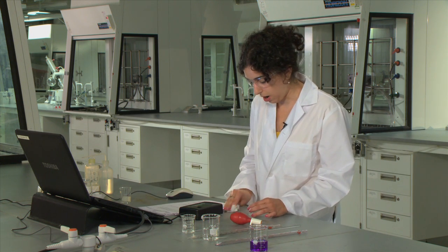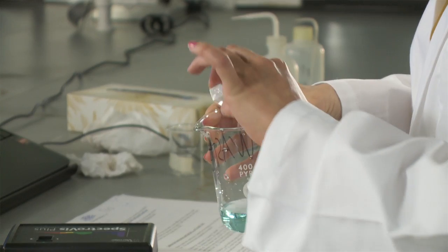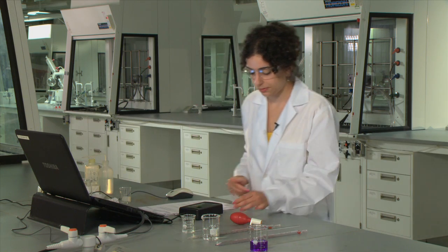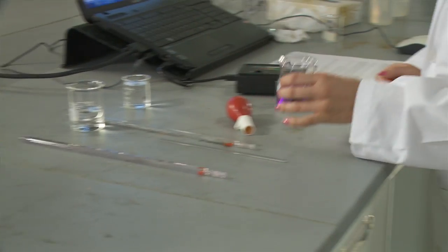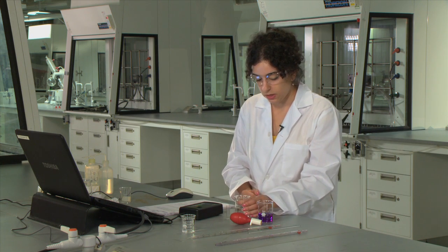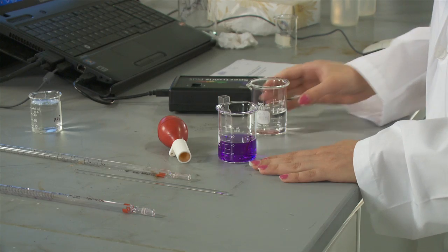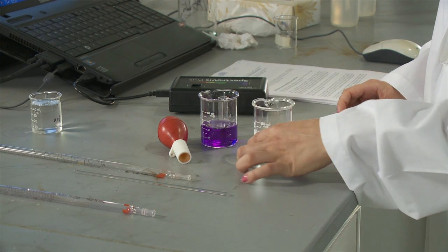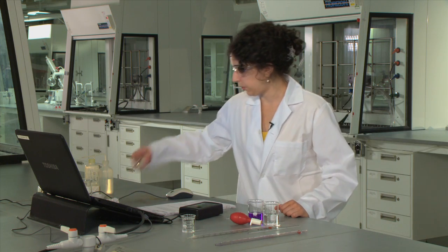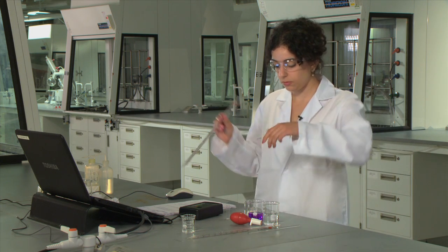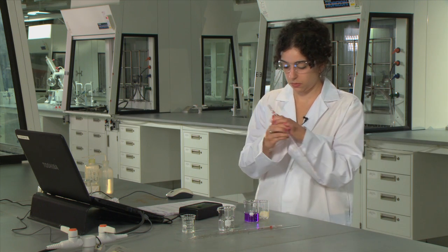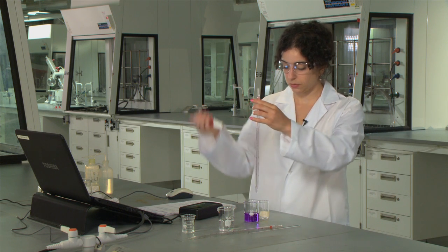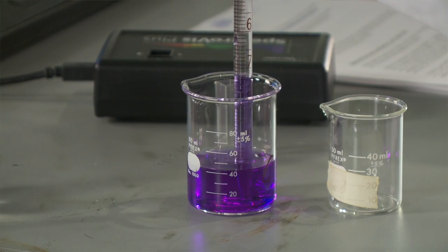So now we'll prepare our reaction. To prepare our reaction, we're going to mix 9 milliliters of crystal violet solution and 1 milliliter of 0.1 molar sodium hydroxide solution. So you'll grab an empty 50 milliliter beaker and pipette 9 mils.